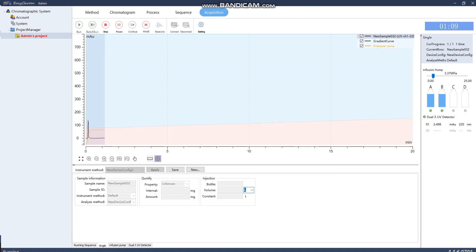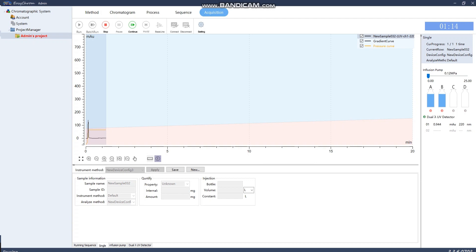If you want to pause at any time, select Pause. Your gradient will pause, but your flow rate is still going. If you want to continue, select Continue. If you want to hold, select Hold. Again, your gradient stops, but your flow rate continues.